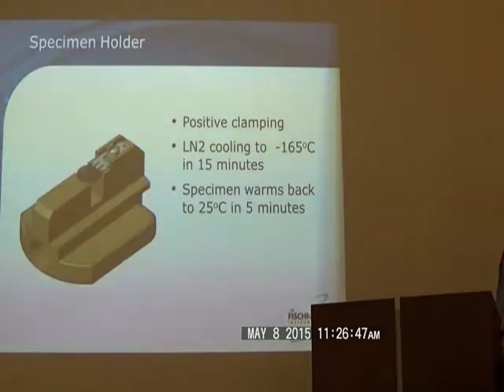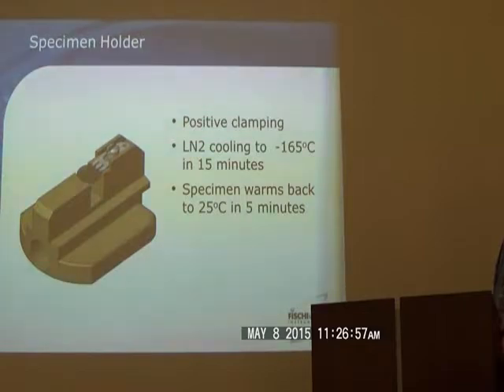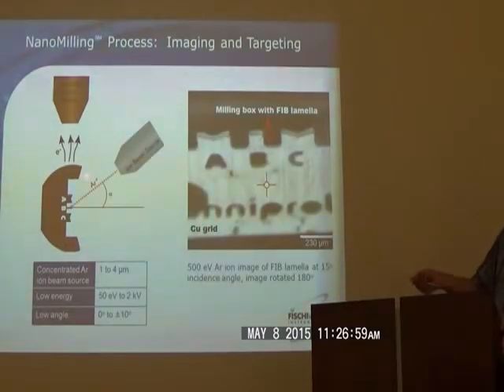Next slide, please. Here's the little holder for the sample. This is a conventional 3mm TEM grid, but a FIB sample would go in basically the same way. And you can go ahead, next slide. And here's the FIB sample. Here's our bread and butter.